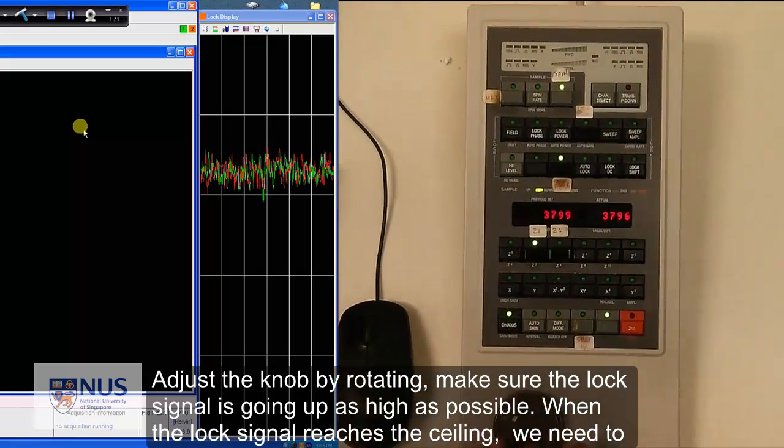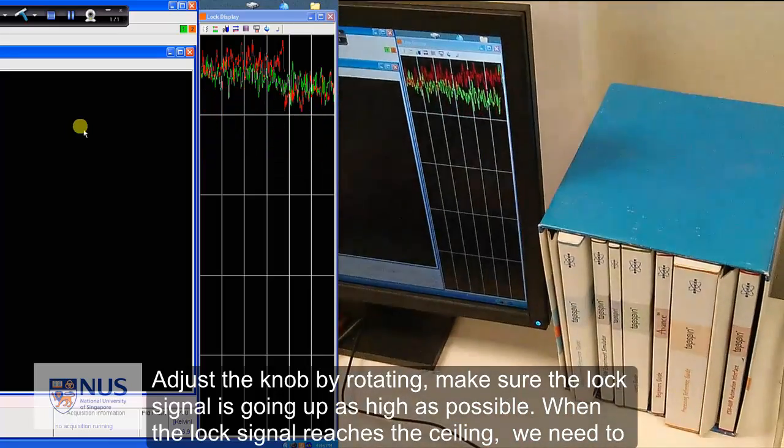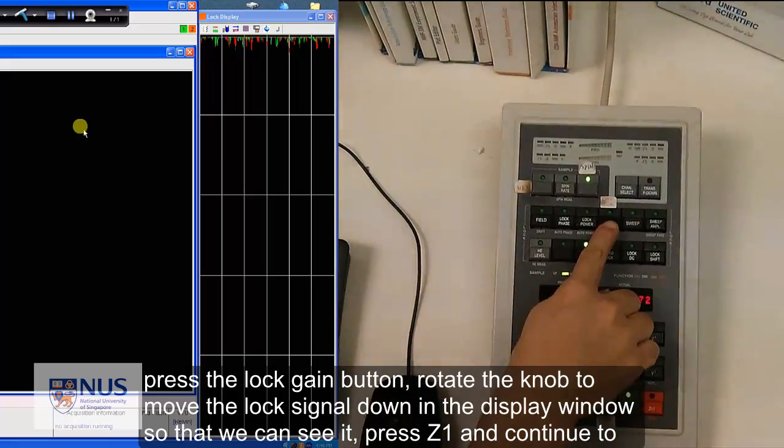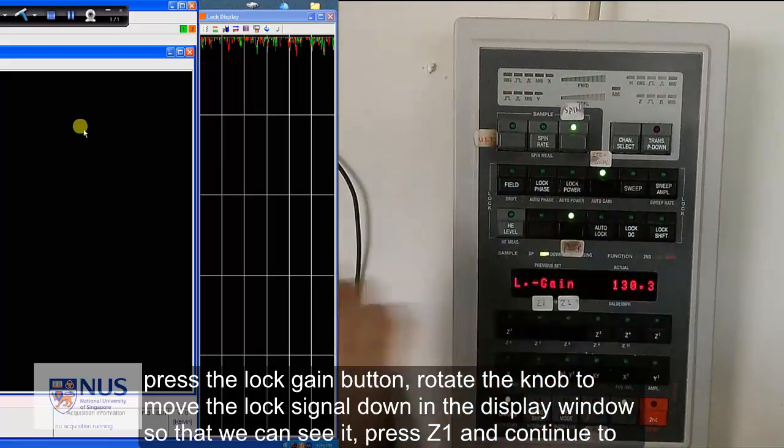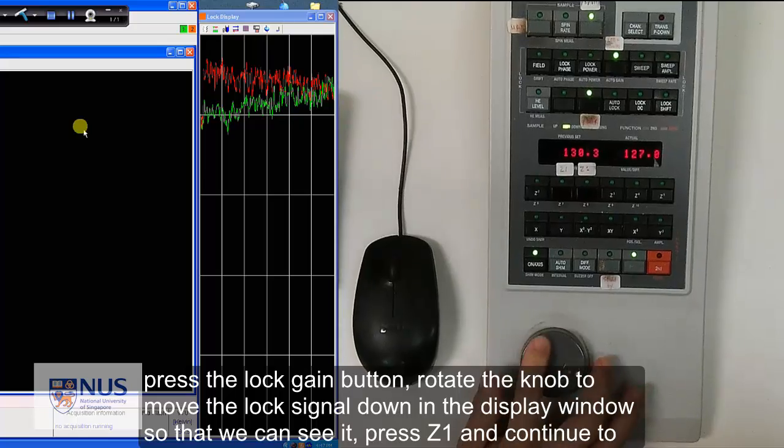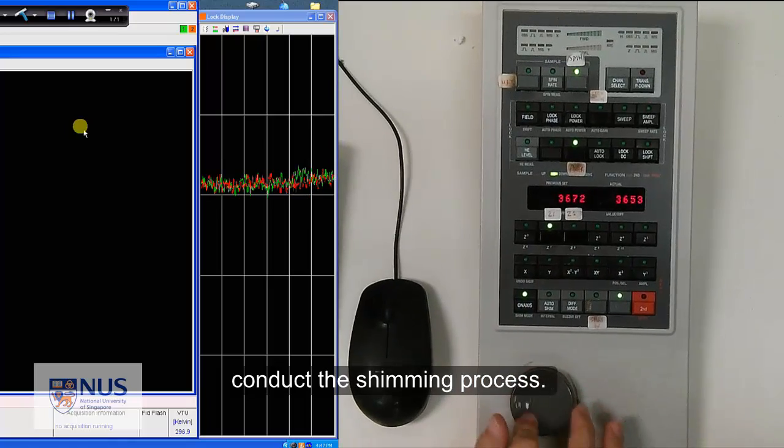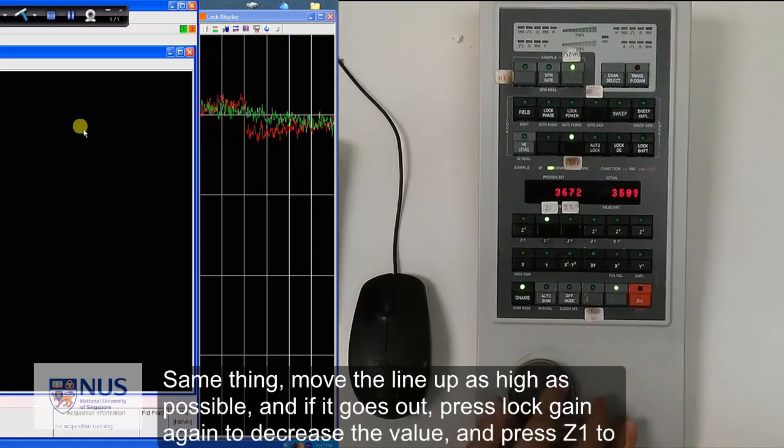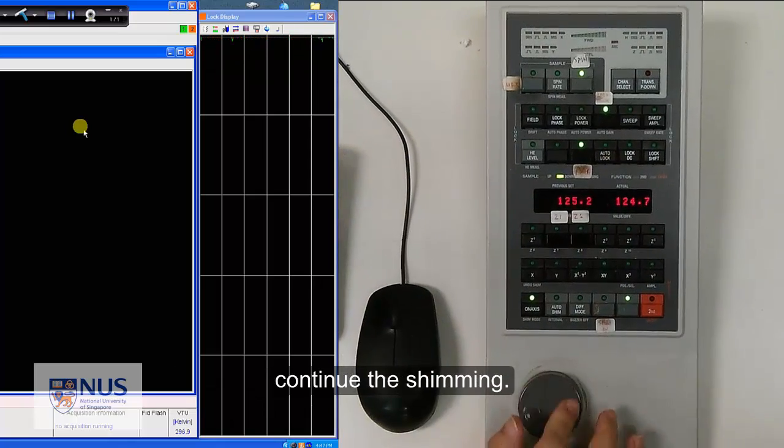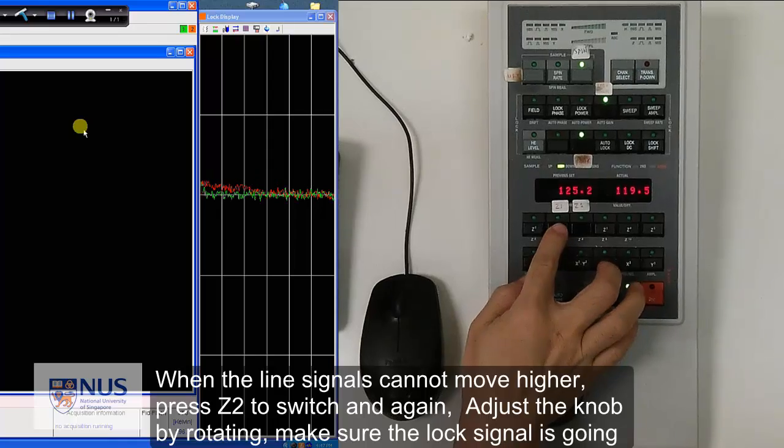Press the button Z. Adjust the knob by rotating, making sure that the lock signal is going up as high as possible. When the lock signal reaches the ceiling, we need to press the lock gain button. Rotate the knob to move the lock signal down in the display window so that we can see it. Press Z1 and continue to conduct the shimming process. Move the line up as high as possible. And if it goes out of the picture, press lock gain again to decrease the value. Press Z1 to continue the shimming.